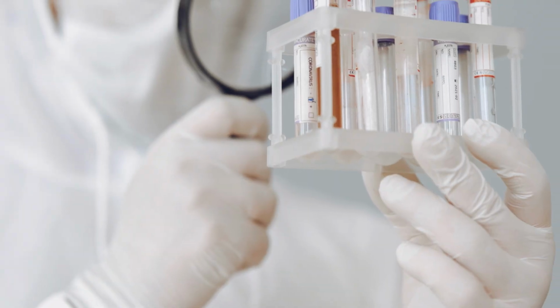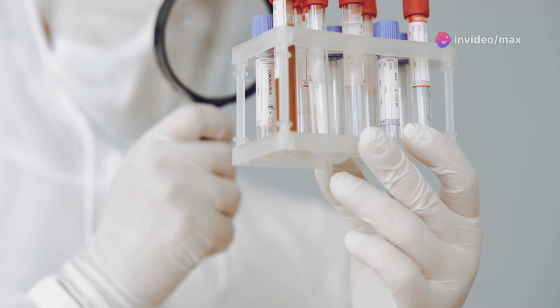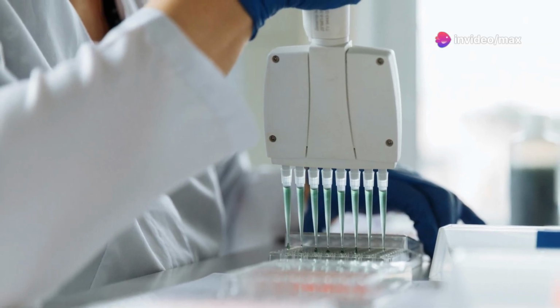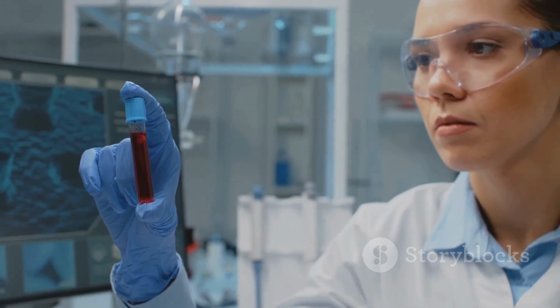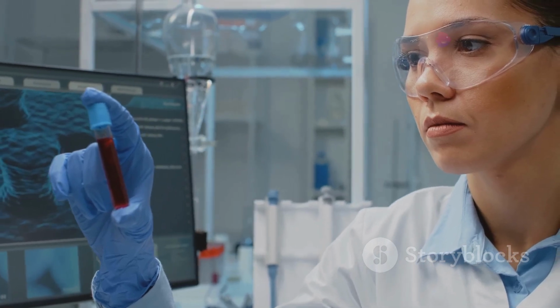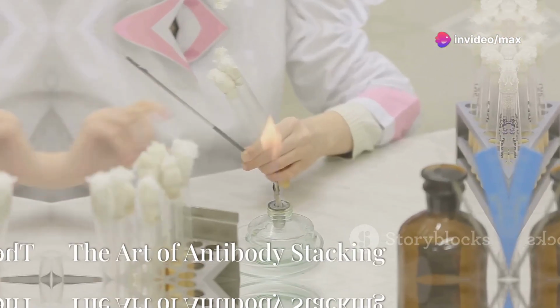The advantage here is that multiple secondary antibodies combine to a single primary antibody, amplifying the signal and increasing sensitivity. Indirect ELISA offers higher sensitivity than direct ELISA, making it suitable for detecting lower concentrations of antibodies.